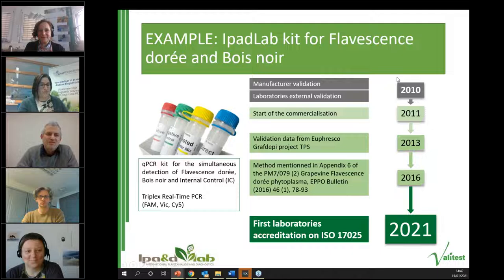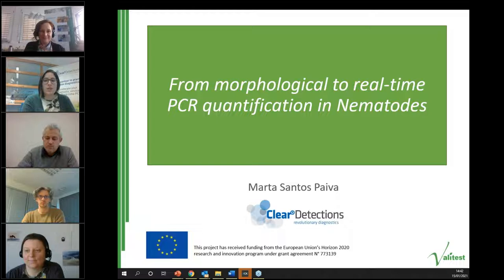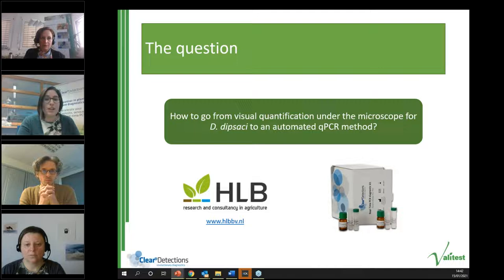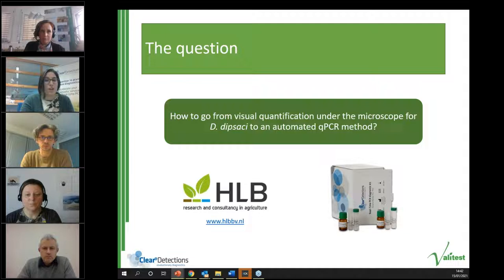Thank you, Camilo. So today I'm going to show you one last example that goes from morphological identification and quantification of nematodes to real-time PCR quantification. So the question that I have to present today comes from one of our partners, HLB Laboratory, located in the Netherlands, who wanted us to collaborate with them to change their traditional method of morphological identification to an automated qPCR method for Ditylenchus dipsaci.